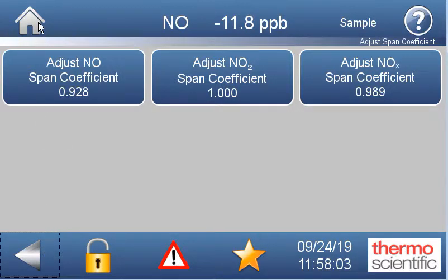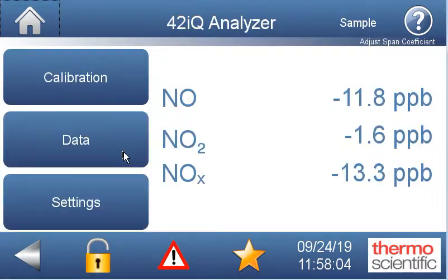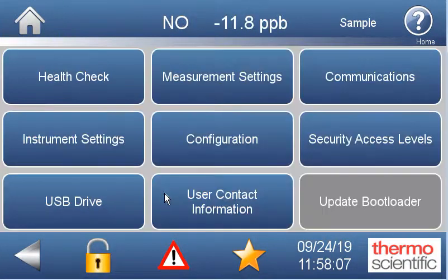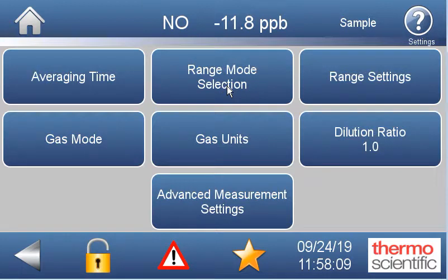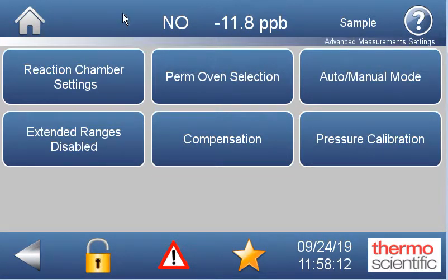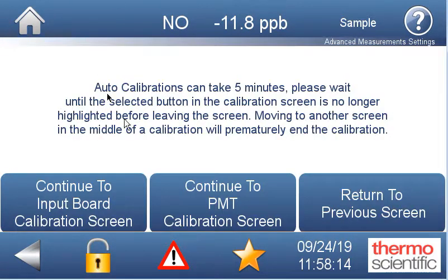We go back to our home — we're still flowing that gas — and we go into settings, measurement settings, advanced measurement settings, reaction chamber settings, and we'll continue to the PMT screen.